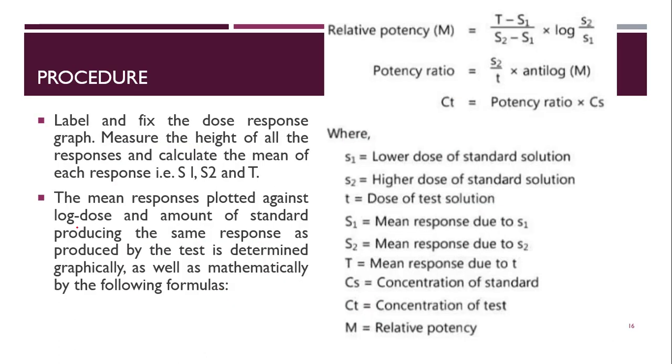Okay, so the procedure continues, that is we have to label and fix the dose response graph.